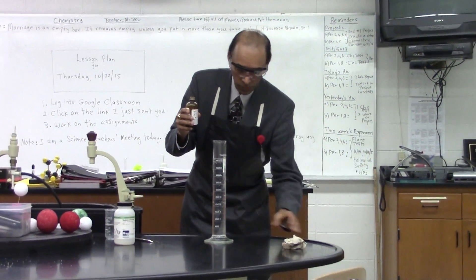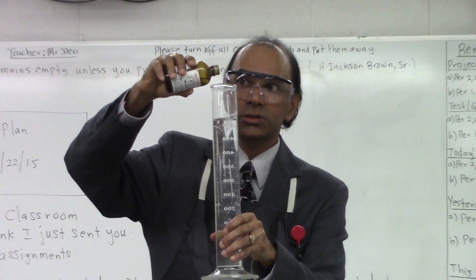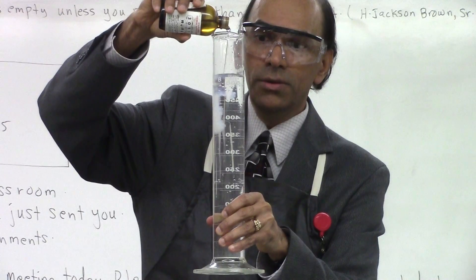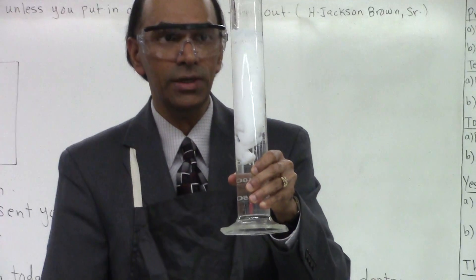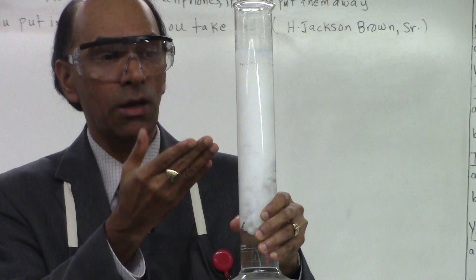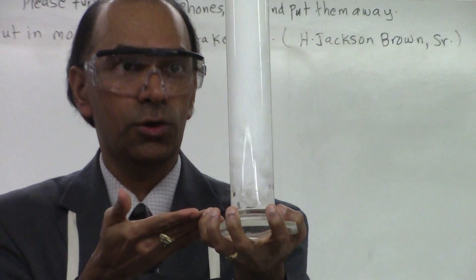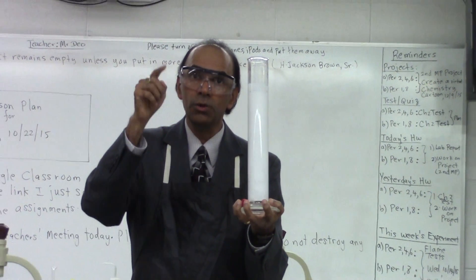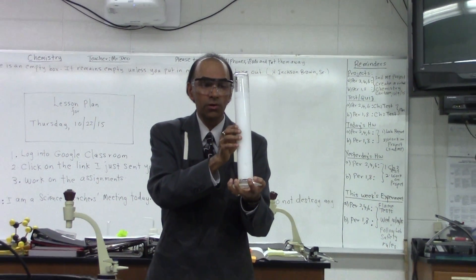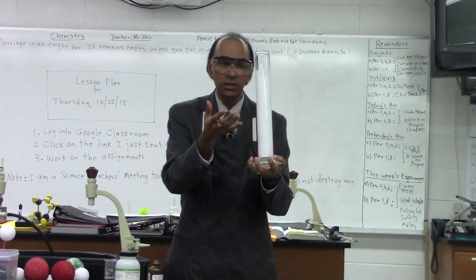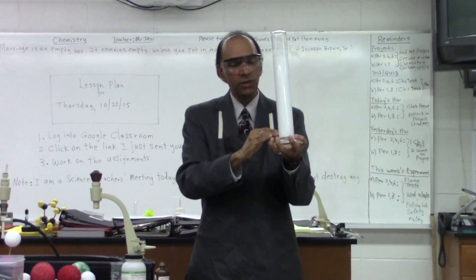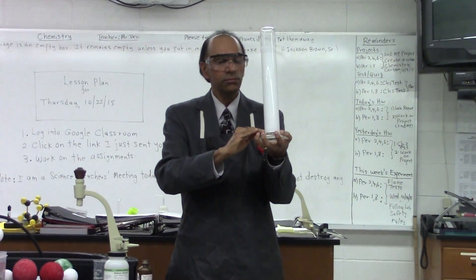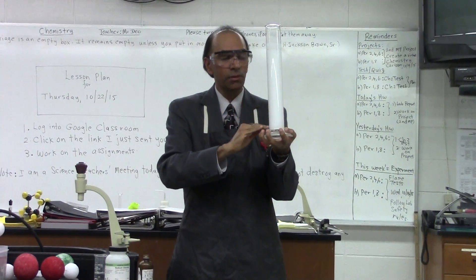All right, let's see what's going to happen here. I'm going to pour some silver nitrate into my graduated cylinder, which has water mixed with salt. You can see there's an immediate reaction, and you have a white substance forming, which is going all the way down to the bottom very quickly. As a matter of fact, this is a test for chloride ions, which is Cl with one negative charge. If I were to leave this for a long enough time, these particles will settle slowly because of gravity and fall to the bottom — they are suspended at the moment and will fall to the bottom as a precipitate.